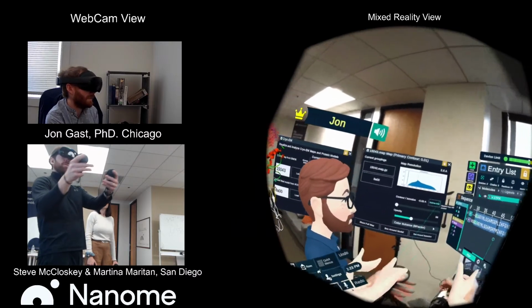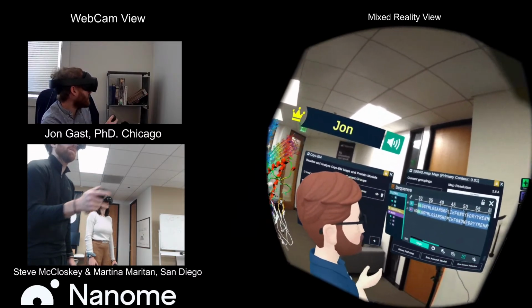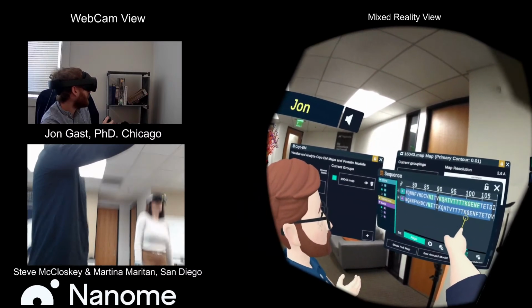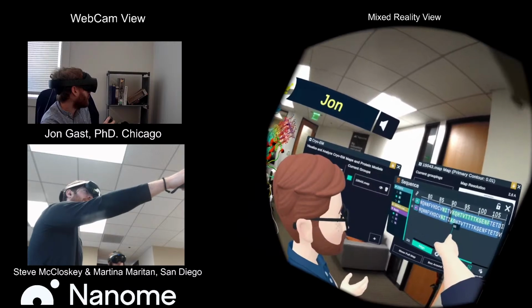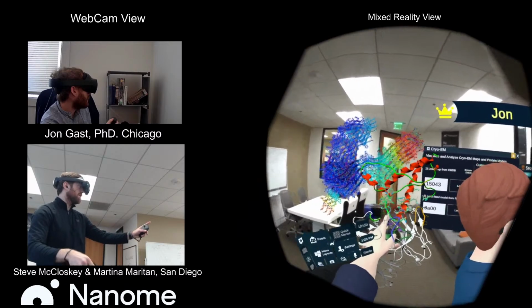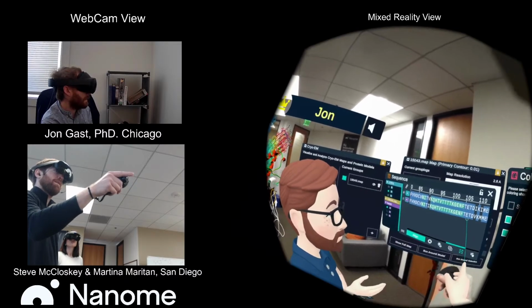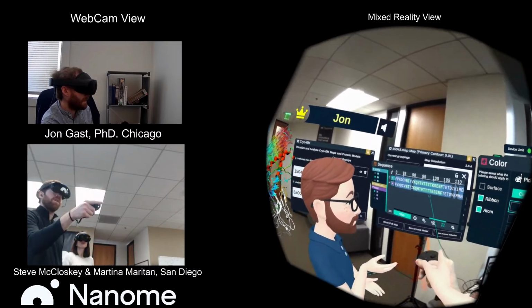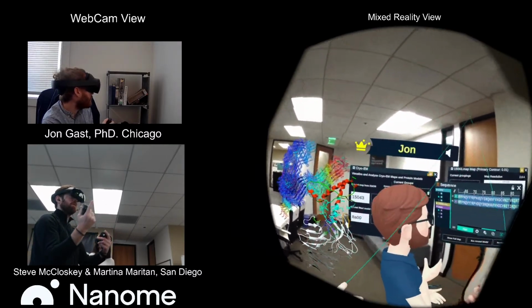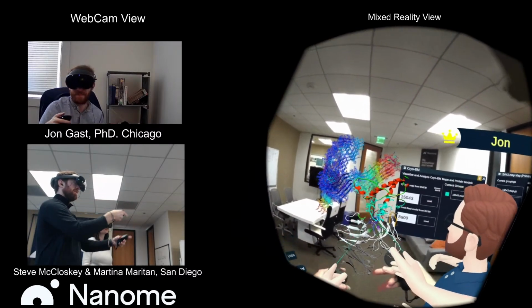John, if you just want to move the menu, we could overlap it on there. Yeah, perfect. So you can see across the sequences that it is the same protein sequence, same protein. What we're doing right now is all of the residues that John has visually selected that are very close to the antibody. He has highlighted them, and now he's highlighting them on the planar protein as well, so that we could look at the same parts that would be interacting with the antibody, both on the 2D planar protein as well as the 3D folded protein that we have with the antibody.